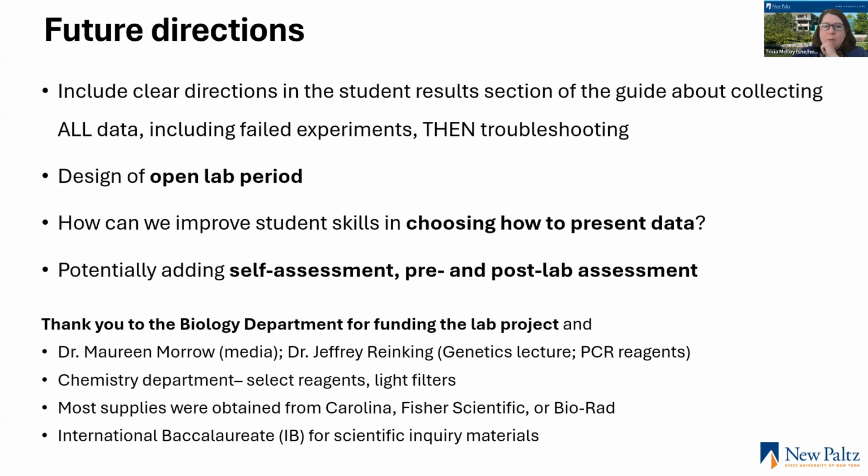So I didn't talk about that, but they were using a UV light box to affect some yeast that were either wild type or UV sensitive in the previous project. So there were some who chose to riff off of that. Others, they did have access to ethidium bromide in a very controlled way. They could use that as a way to try to affect the DNA. But most of them were using one of those approaches.